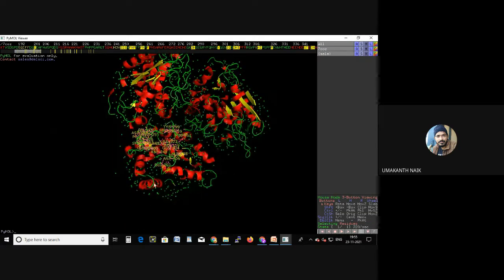These residues, the 4 angstrom region residues or pocket chain residues, tell us the grid generation. We can generate the grid there when we prefer to go for local docking. When you are going for global docking, it is not required to go for pocket chain. You can dock by selecting the entire protein. But when you want to bind only at that particular site of that particular amino acid, then you can find the pocket chain. Are you able to follow what I'm saying exactly?